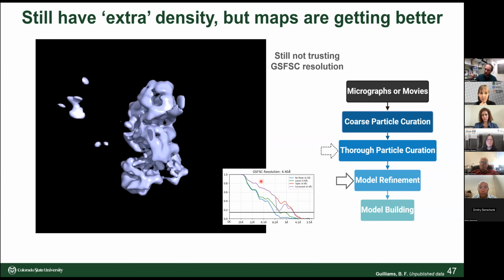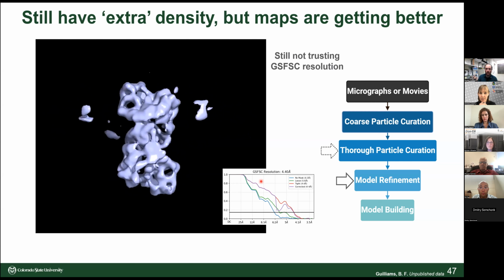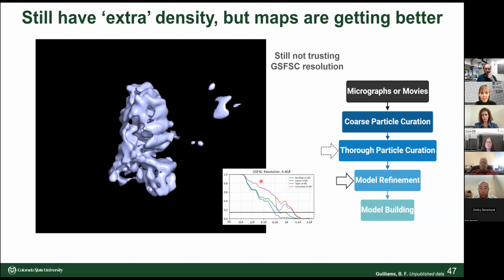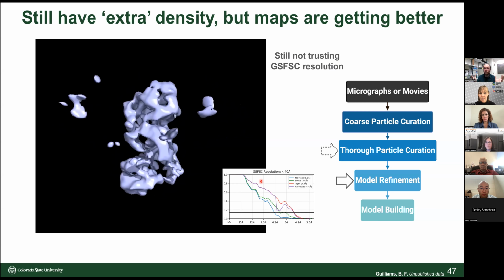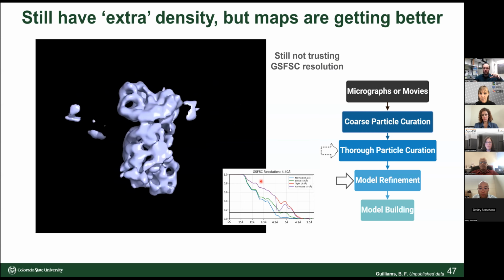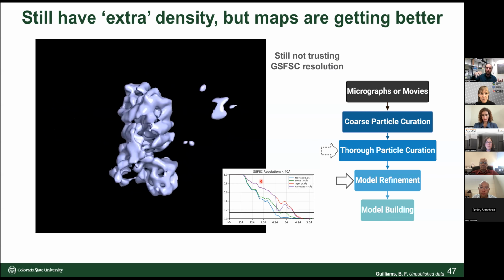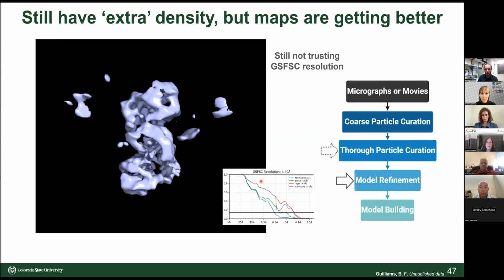With our collaborations at Chan Zuckerberg Imaging Institute, there's lots of people interested in really improving subtomo averaging. One of the problems they're talking about is the alignments in these subtomograms. Right now the linker is flexible, so there's not some rigid orientation between the nanoparticle and the protein of interest. But we're thinking of adding a more rigid linker as a way of defining this position between the nanoparticle and the protein of interest a bit more.